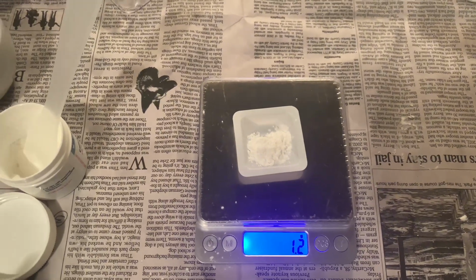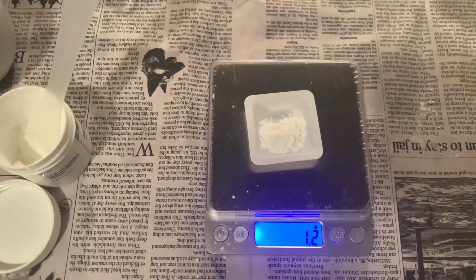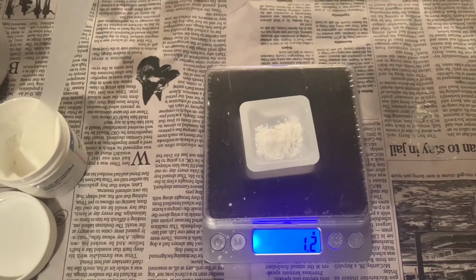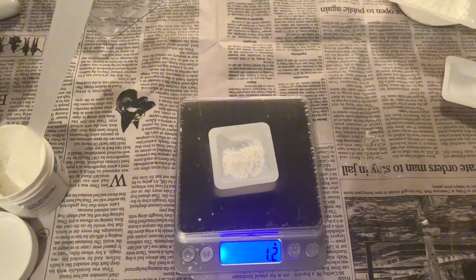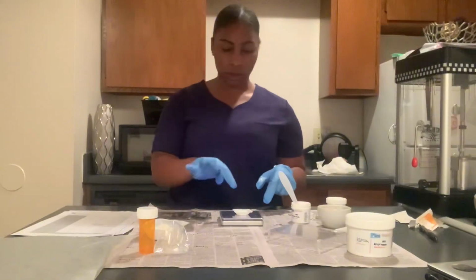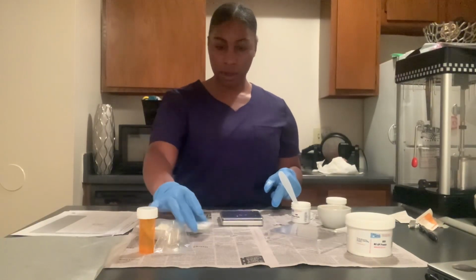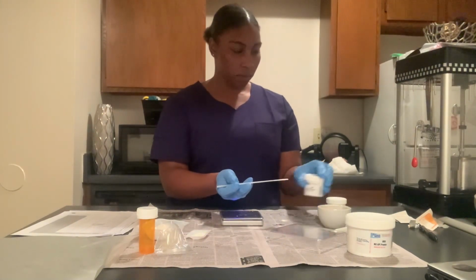So there it is. It keeps going up and down, honestly. So it's 1 gram, just over just a little bit. So that is 1 gram, 1.1, 1.2 of our caffeine. Move this over and put it right here because we're finished with that.